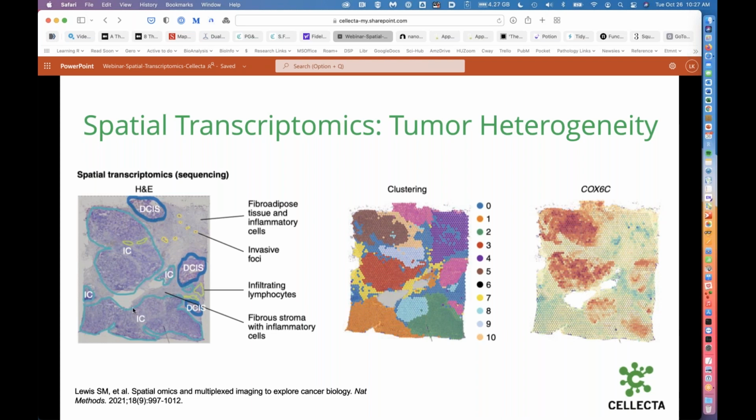And by applying spatial transcriptomics, we learn from gene expression that there are different patterns that cluster, and the clustering occurs even within histologically similar areas of tumor, emphasizing the heterogeneity of tumor and the heterogeneity of their biology, even within this very limited area. And this clustering can be further analyzed even at the gene level.